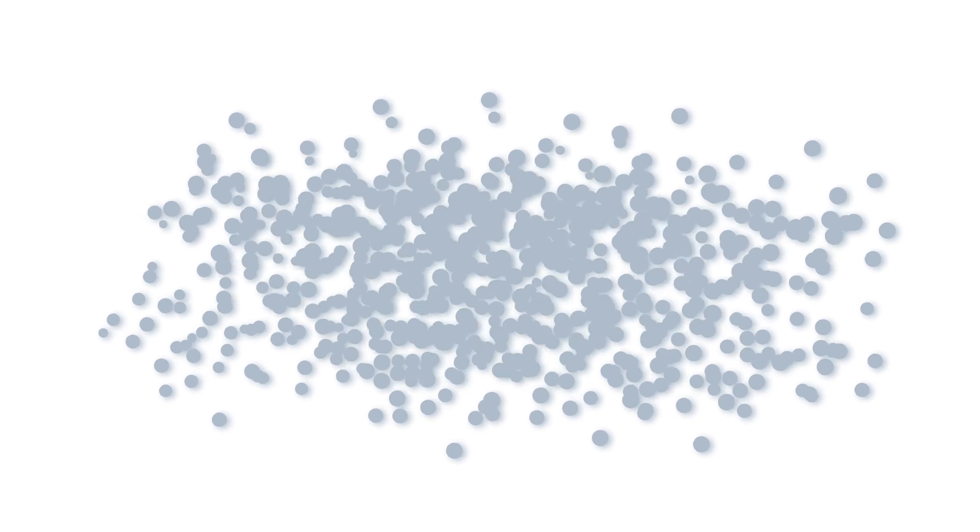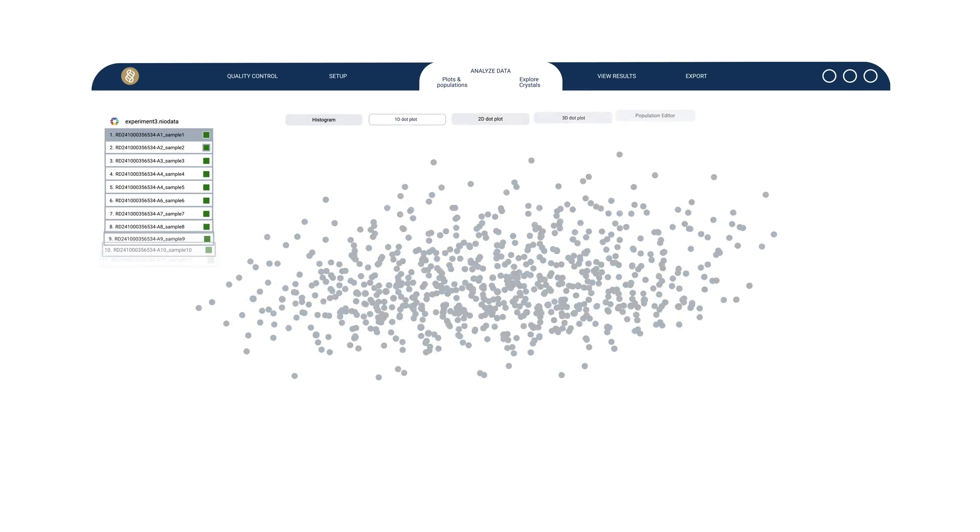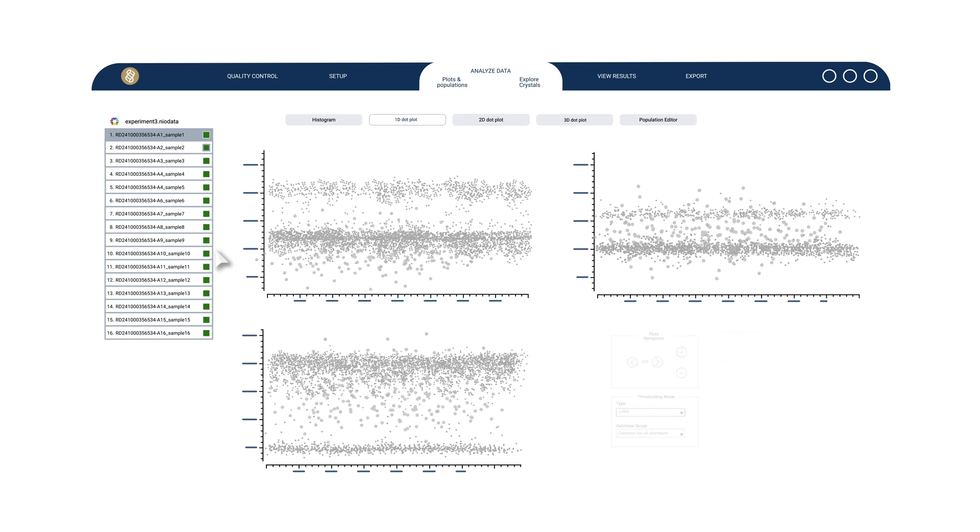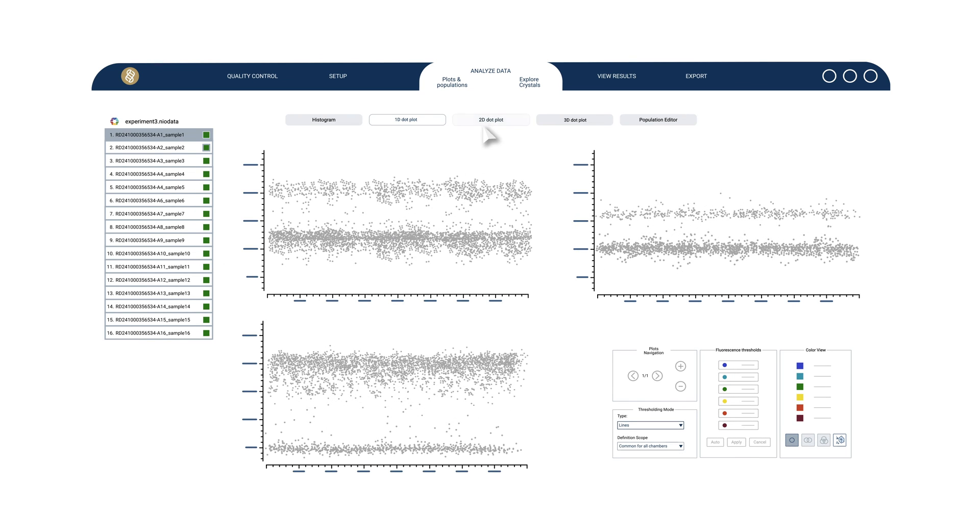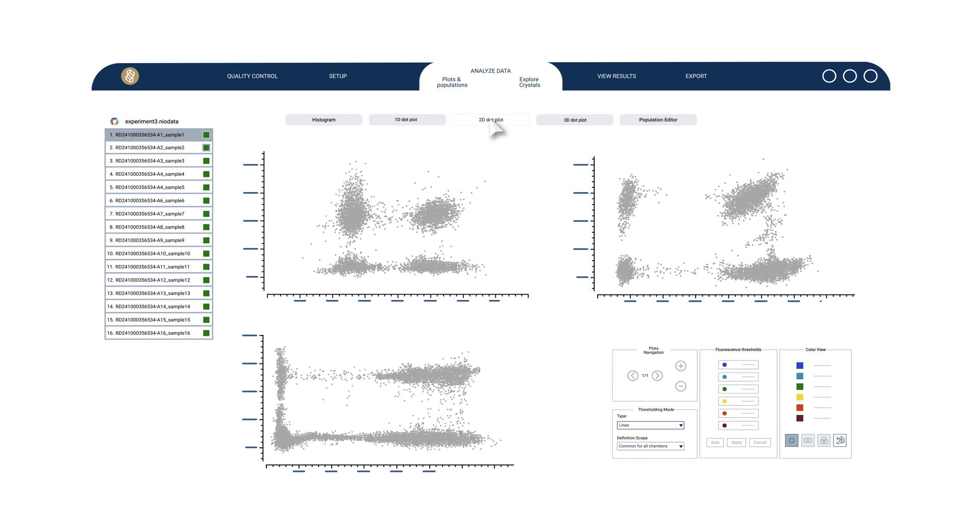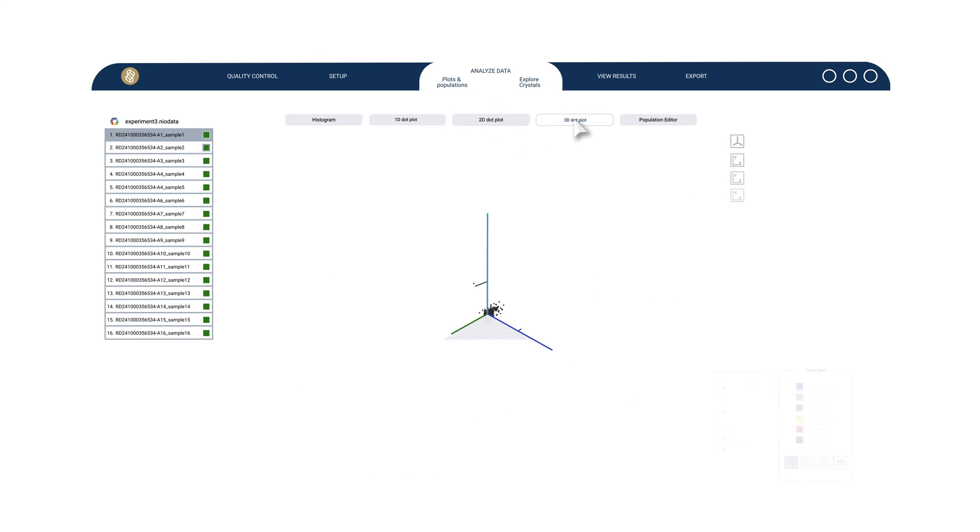On Analyzer, you can view data across the dimensions you need with a 1D, 2D and 3D plot.